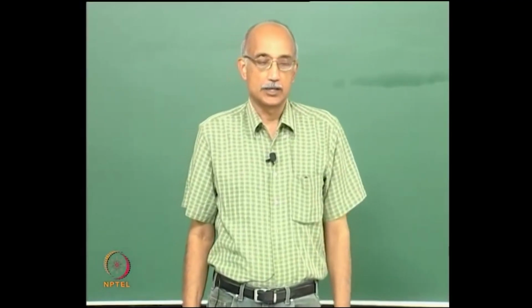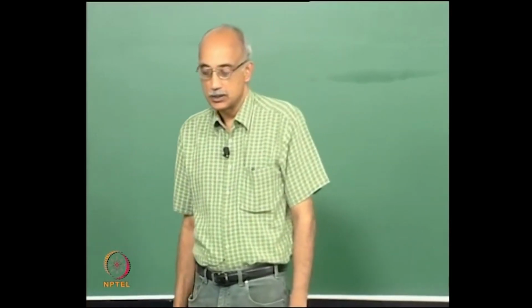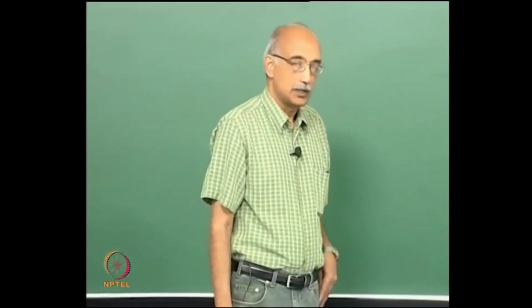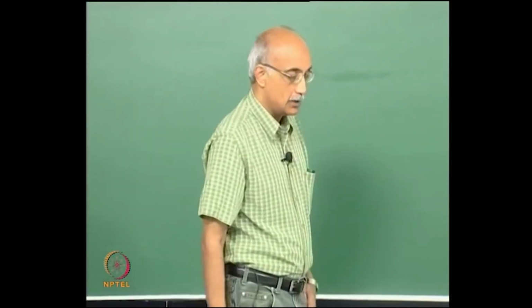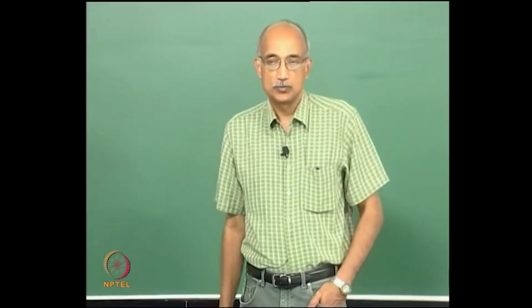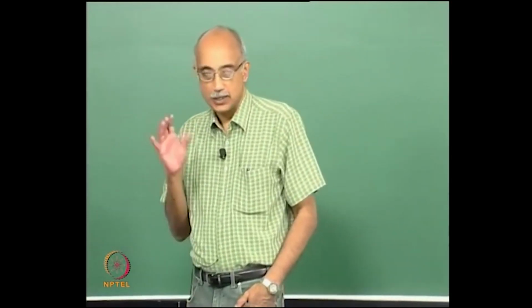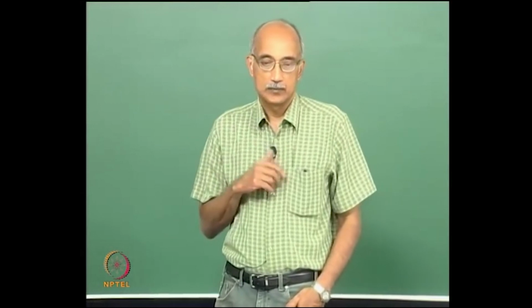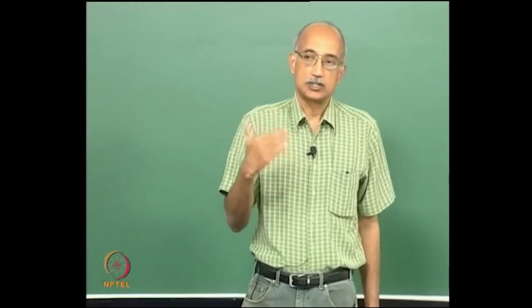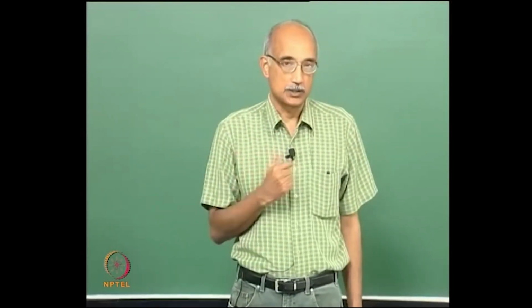Welcome to the 11th lecture in our particle characterization course. In the last lecture we were discussing particle size distributions, and we noted that size distributions can be obtained in essentially a tabulated form. Most particle counters will give you a count of particles by size in various size channels. They will report differential counts of particles only in that channel, as well as cumulative counts of all particles that are larger than a particular size.